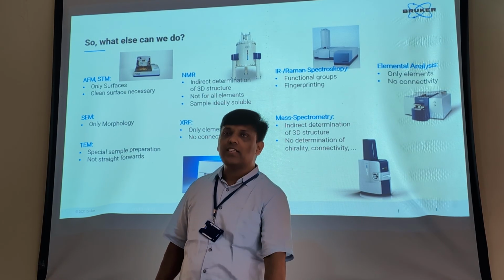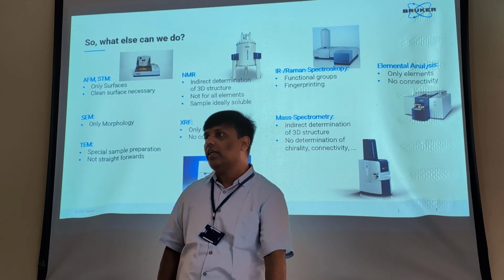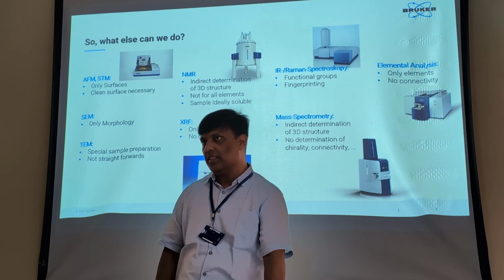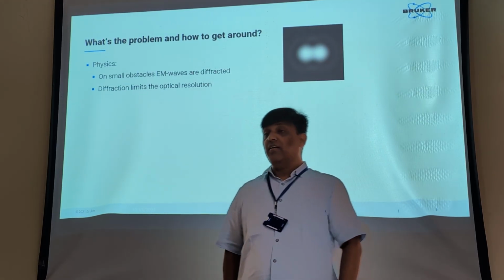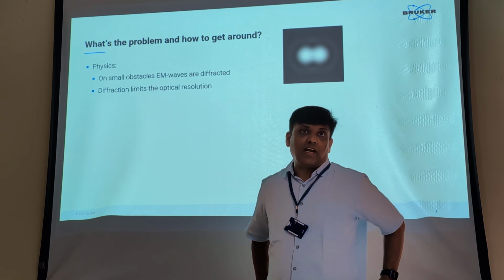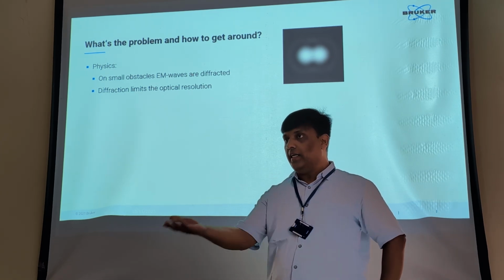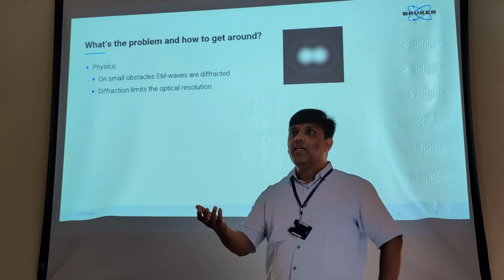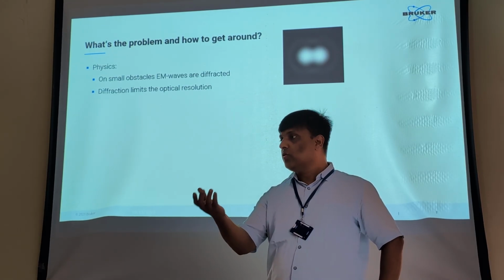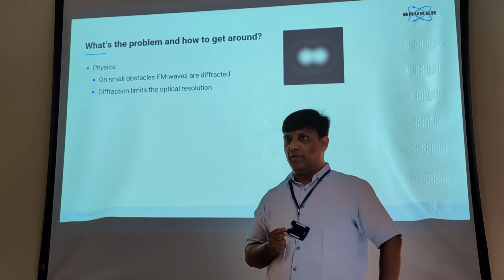So what is the alternative you can do? You can recall your 10th class or maybe 12th class diffraction experiment. If you shine light on any material, it gives a diffraction. From that diffraction, you can get information about that particular material.